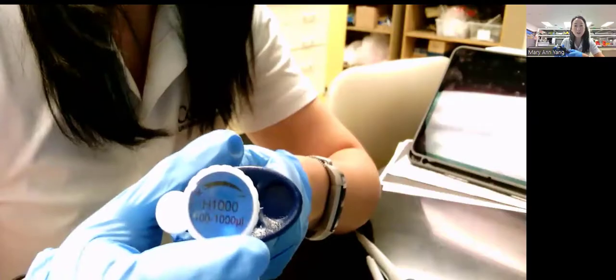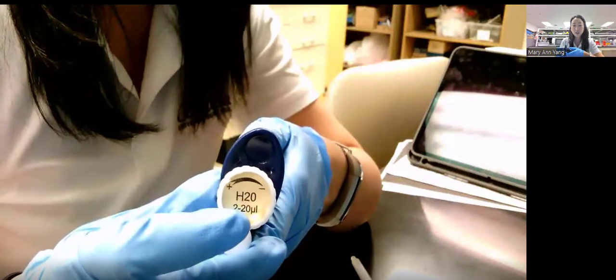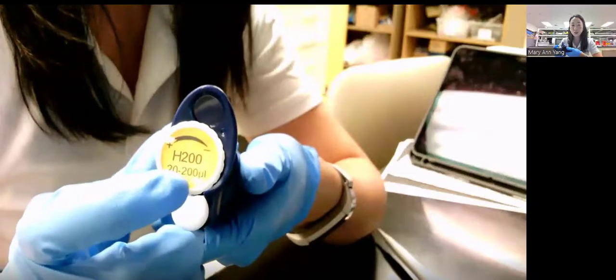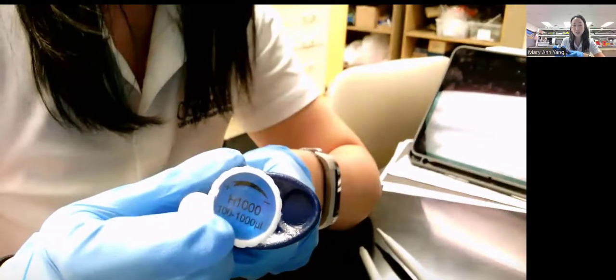Hopefully by now you have figured out how the name works. The name suggests the largest amount that the pipette can measure. So for P20, it goes up to 20 microliter. For P200, it goes up to 200 microliter. And for P1000, it goes up to 1,000 microliter.